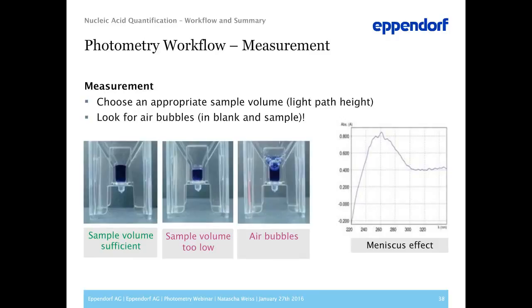Please ensure that the minimum volume required for the cuvette type is used. It is advisable to always take some microliters in excess in order to avoid a meniscus effect. Not only large air bubbles like the ones shown on the picture, but also smaller ones, which are not visible at first glance, can influence the reading. Therefore, always check blank as well as sample solution for air bubbles prior to measurement.